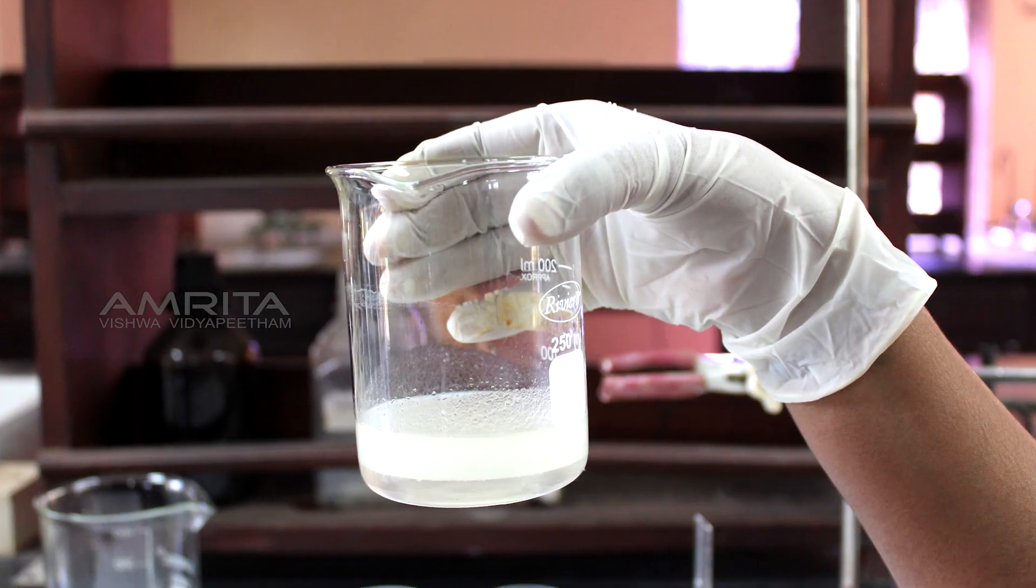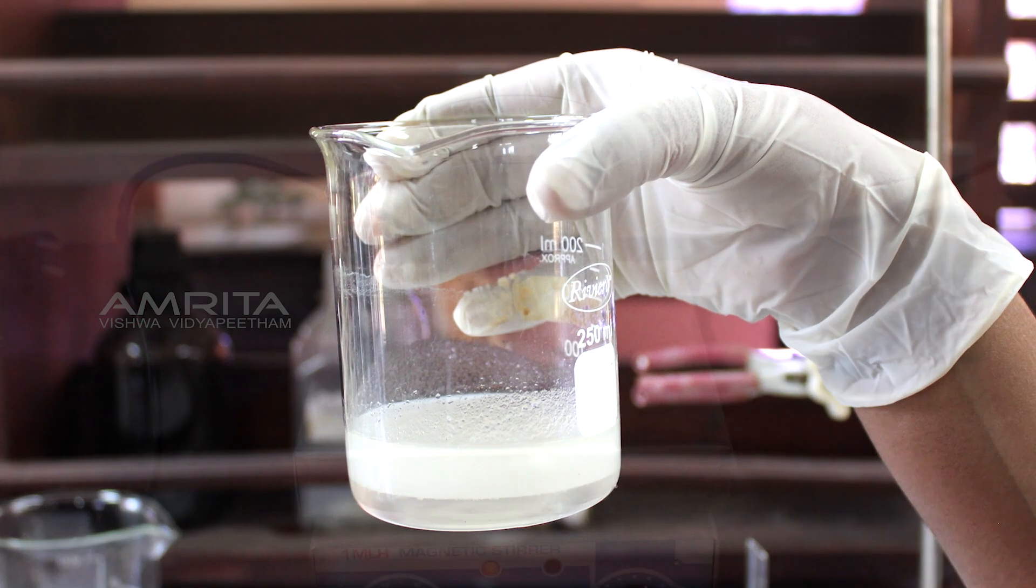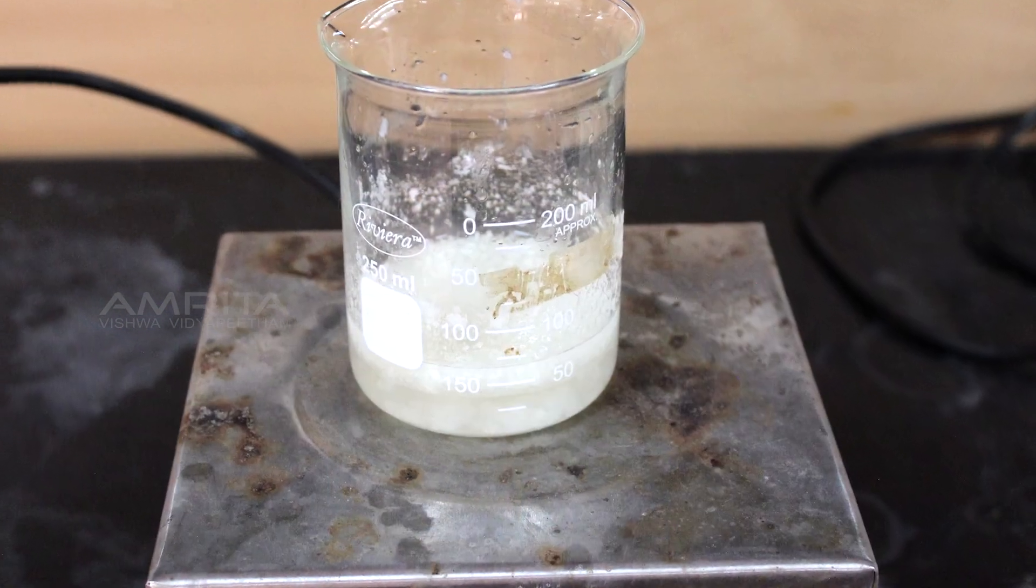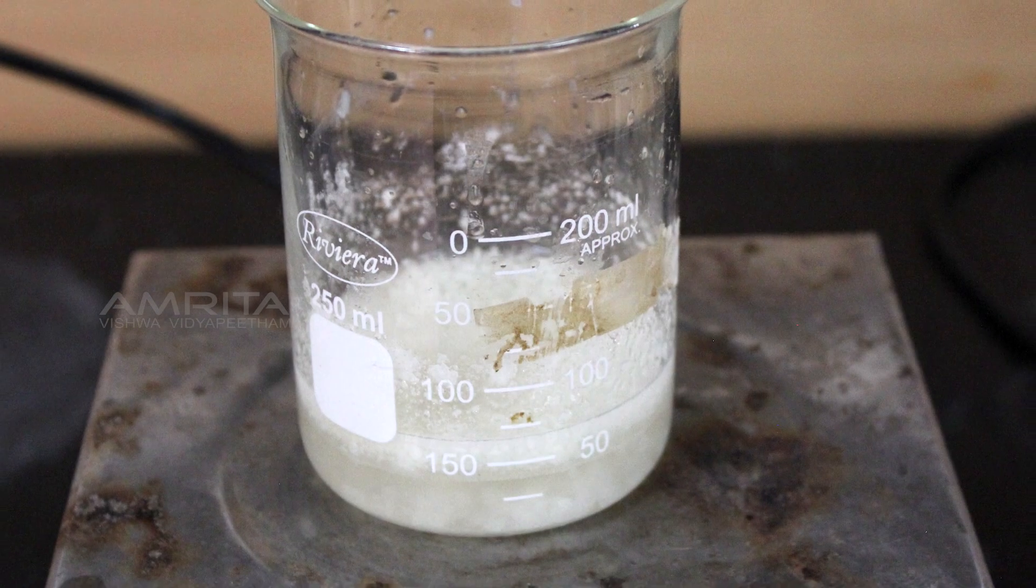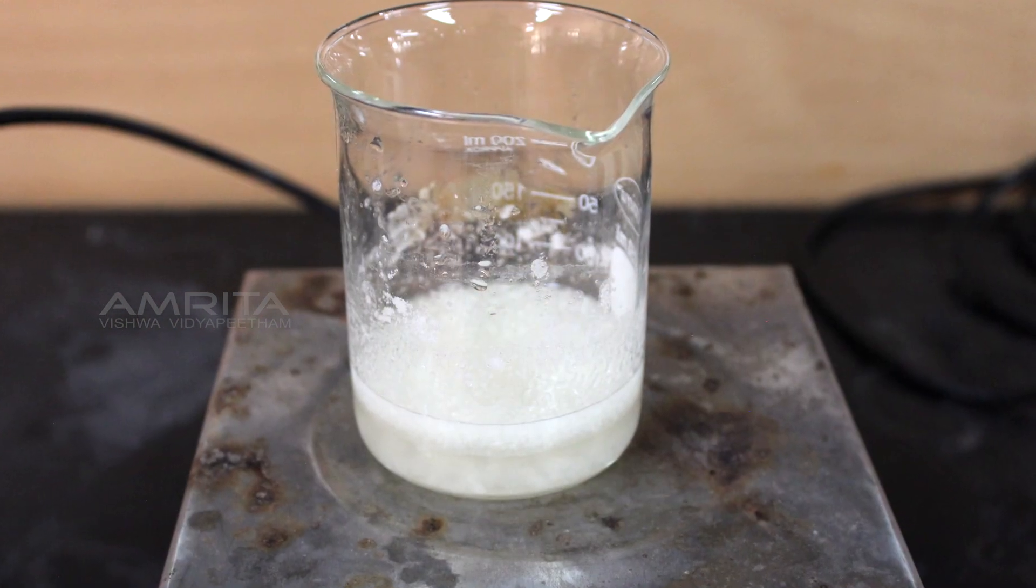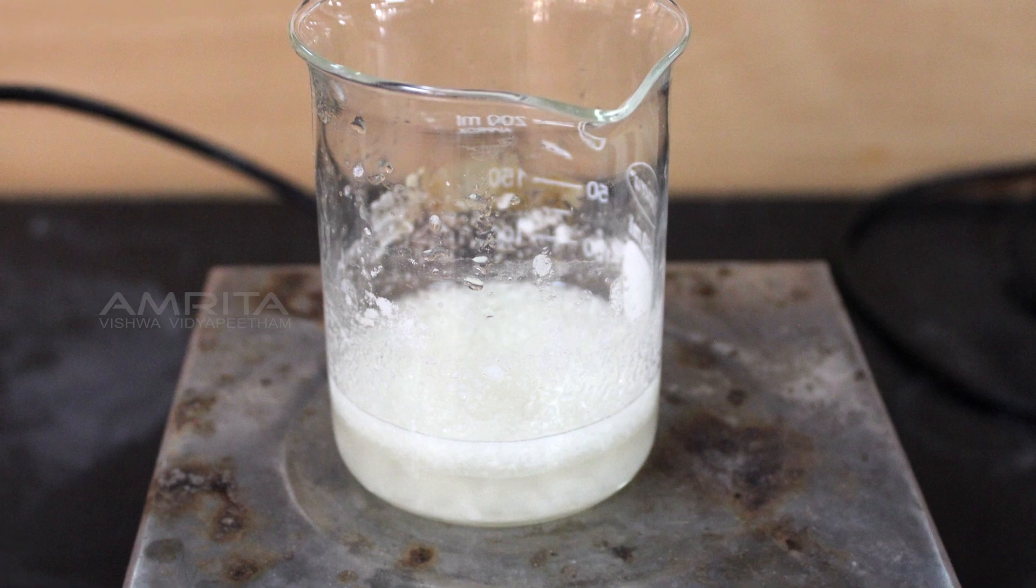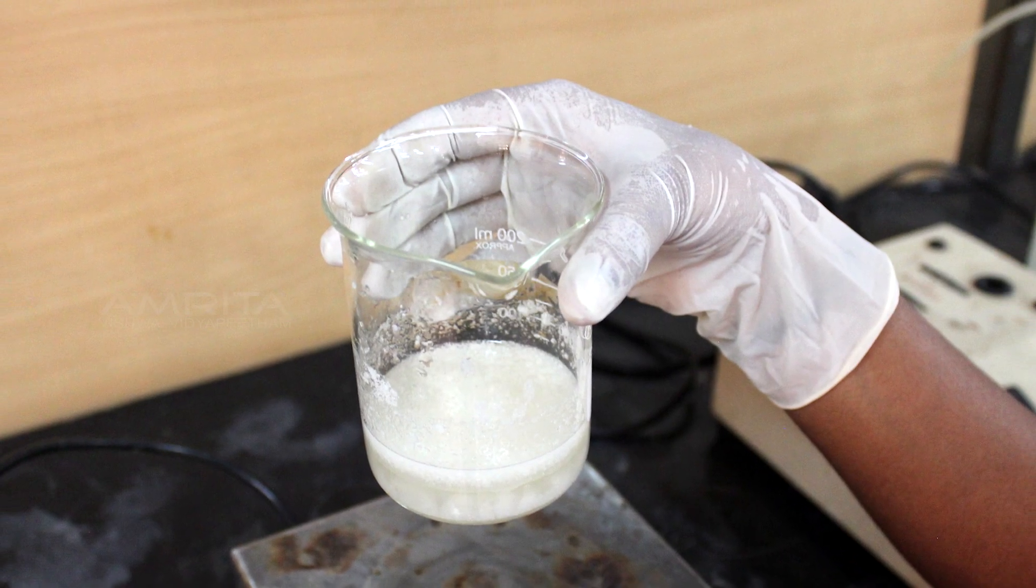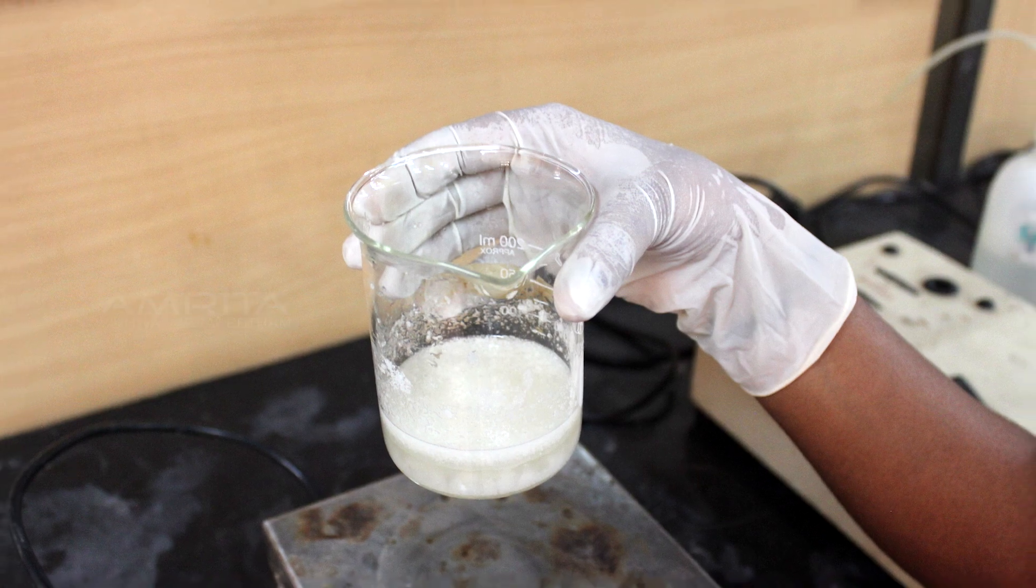Take the beaker containing the mixture and place it on a hot plate. Heat the beaker using the hot plate till the mixture becomes a whitish paste. The white suspension formed is made up of soap and glycerol. This process of formation of soap is called saponification.